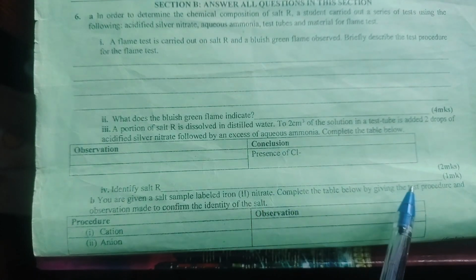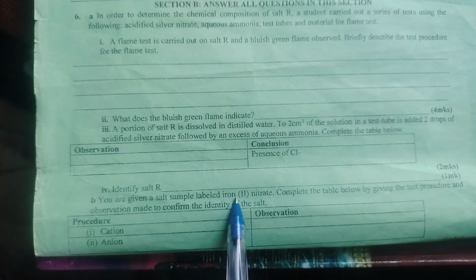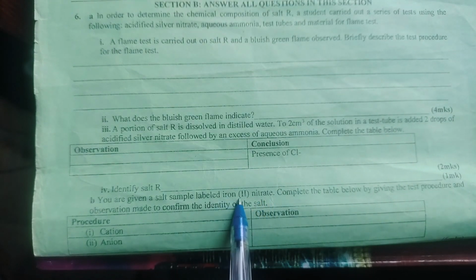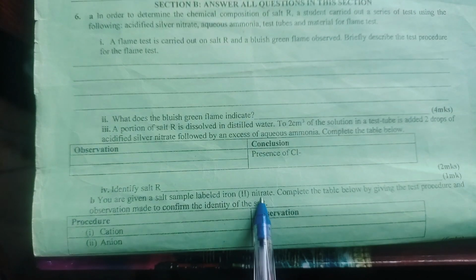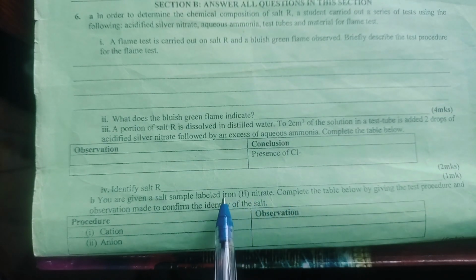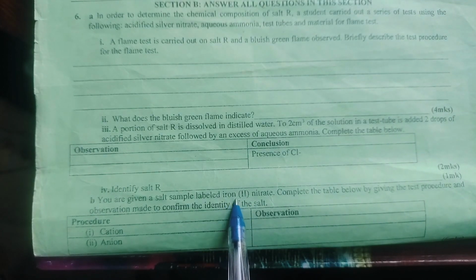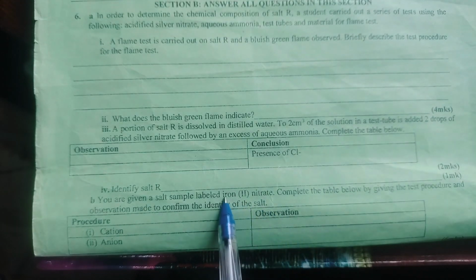You are given a salt sample labeled iron 2 nitrate. Complete the table below by giving the test procedure and observation made to confirm the identity of the salt. Our salt is iron 2 nitrate. What is our cation? Iron 2. Our anion, nitrate. We can test for the presence of iron 2 ion using sodium hydroxide. Here we are going to have dirty green. See, it is iron 2.